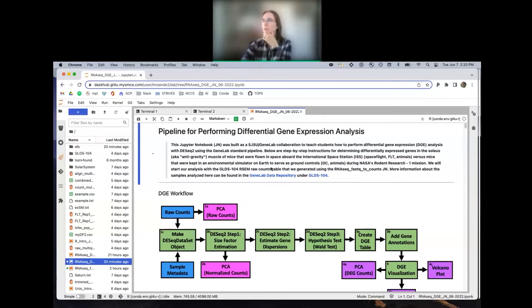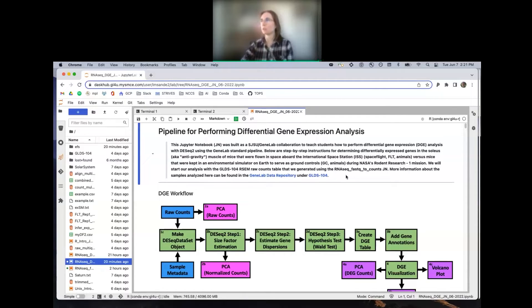As the description says, we're going to determine significantly differentially expressed genes in the soleus muscle of mice that were flown in space aboard the ISS, comparing spaceflight animals versus mice kept in an environmental simulator on Earth — the ground control animals. This is from NASA's Rodent Research 1 mission, and we're going to start with the RSEM raw counts table that we just generated at the end of the RNA-seq FASTQ counts Jupyter notebook.